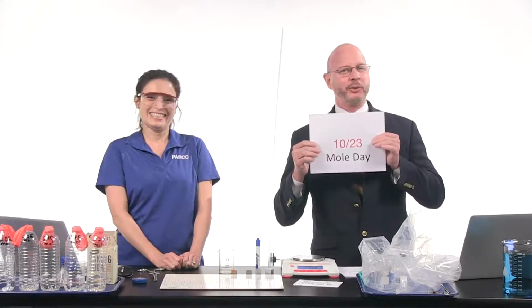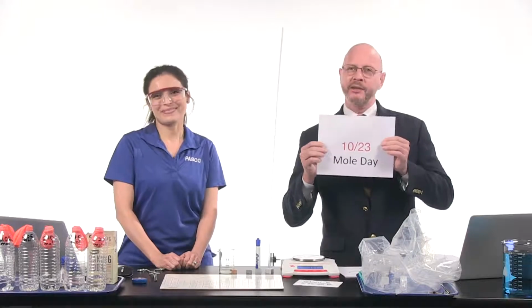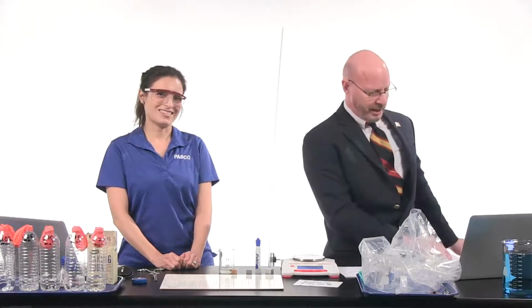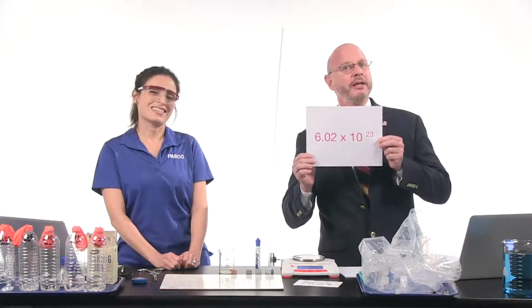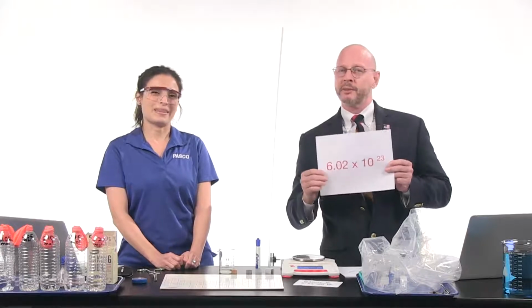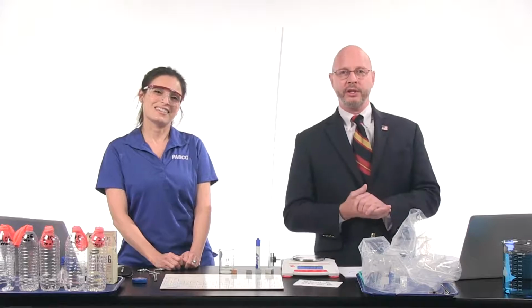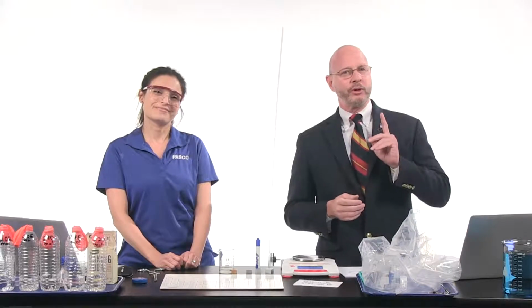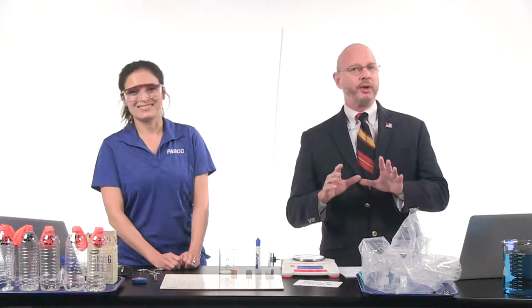Tomorrow is 10/23. October 23rd is Mole Day. And why is 10/23 Mole Day? Because a mole is 6.02 times 10 to the 23rd. Now, this is a very, very important concept in chemistry, an extremely important concept really for all things that we teach in chemistry. And what we're going to be showing you today are some great things that you can do at home, that you can do in the lab.